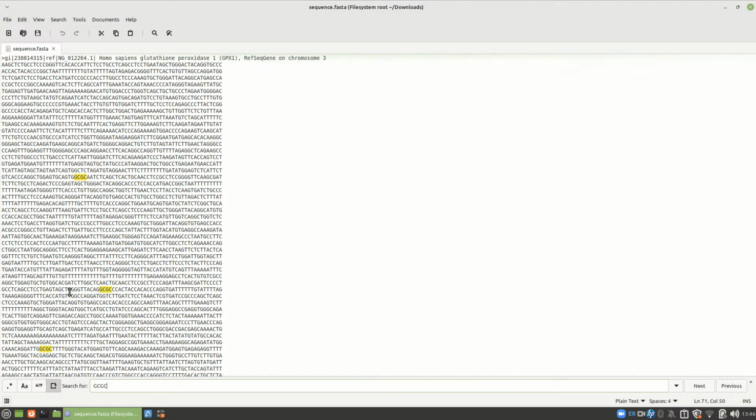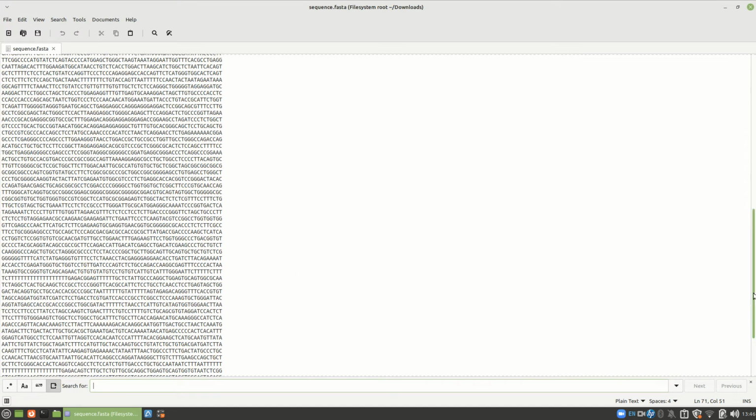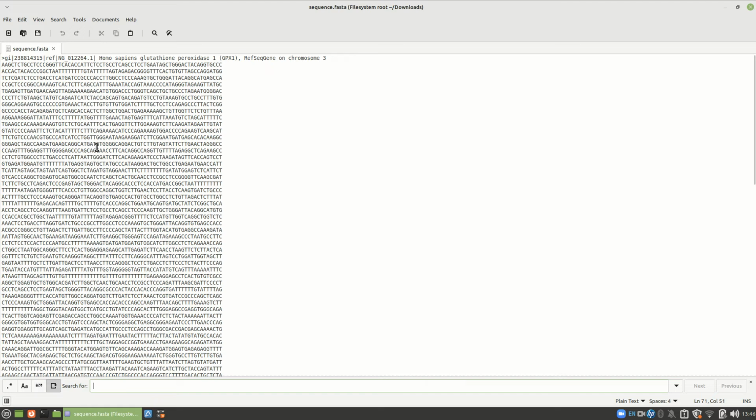Now, in humans, it works pretty well. I'm going to show you how to find your likely location of your gene. And now in EHUX, it's not going to work as well, but EHUX is the name of the algae we're using for our project 3. It's not going to work as well as it would in humans, all right? But it will work. And I'm going to show you here, and I'm actually going to help you out. I'm going to go through each of your genes and we're going to do this same exercise for all 6, and you'll get to see what's going on in your particular sequence, and I'll give you some hints.